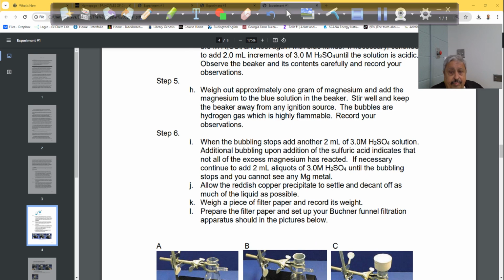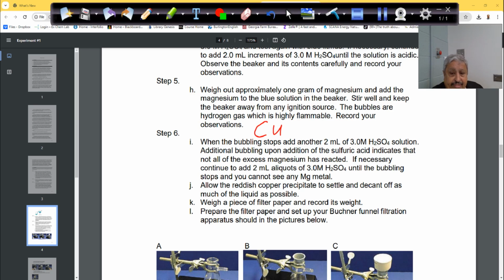you get magnesium and stir it into the whole thing here. Magnesium will kick out the copper from your copper sulfate. So step 5, let me just write it here. You have copper sulfate, remember, plus hydrogen from sulfuric acid. We are interested in this.